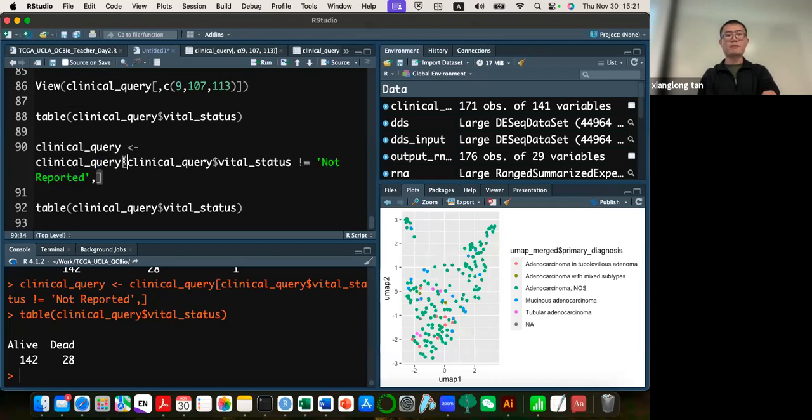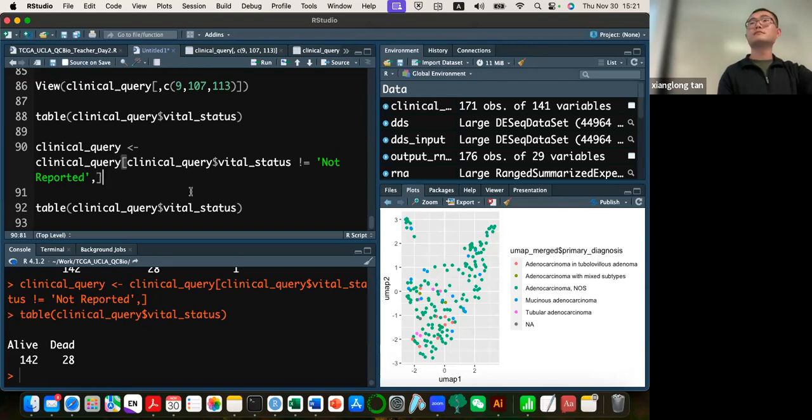Something like maybe it's a square bracket instead of a curly bracket, like that. And it's a case sensitive situation.